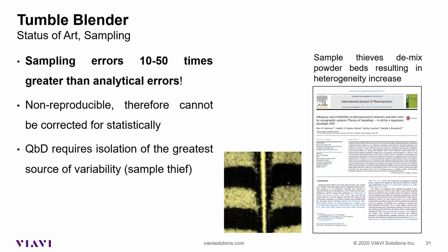Once we have this hole, obviously it is not remaining for a lot of time, because depending on the different particle size inside the blender it is immediately filled by the finer particles. Okay, and this is a clear problem, because if you repeat this sampling 10 times to take out the sample that you bring to the laboratory, you achieve two things. The first thing is that your blending is heavily damaged by the sampling. So it's up to you what you want to do, but it's for sure not the product that you had before the blending. And this is clearly stated in the article that is on the right-hand side. And also that the information that you are getting is not representative of what you have inside your blender.